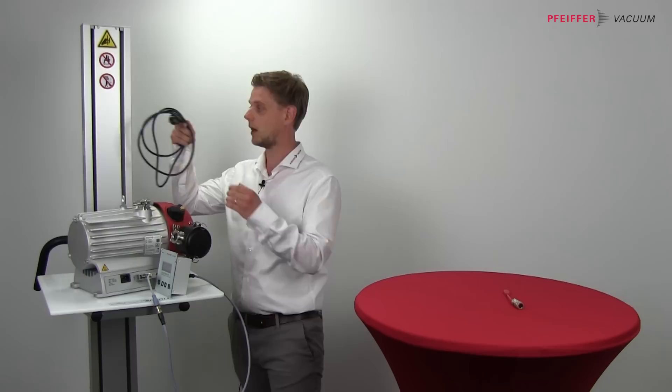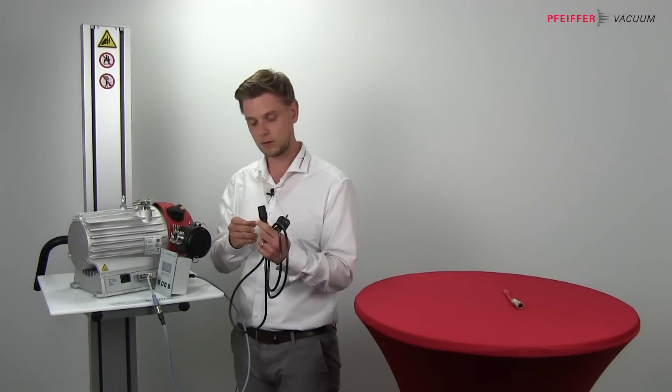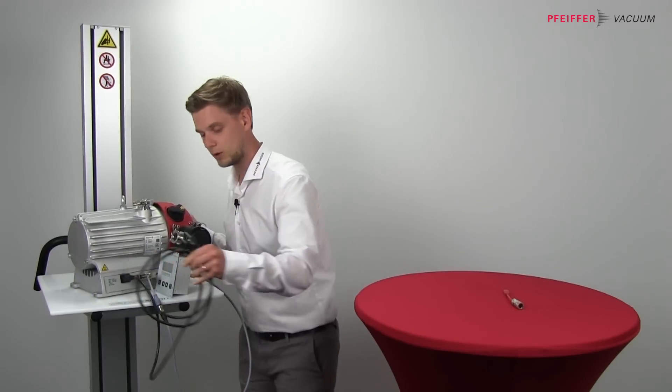And now we should connect the power to the pump. First of all the plug at the pump. Then the other one.